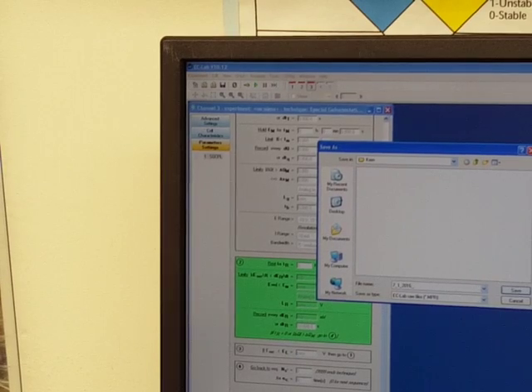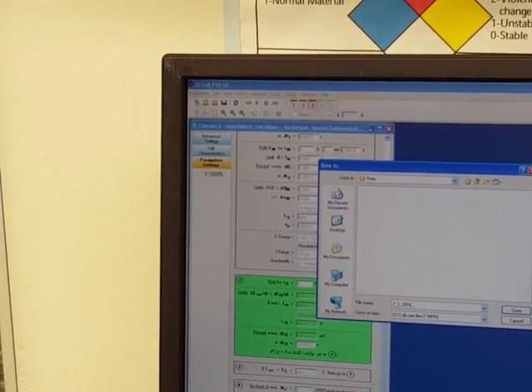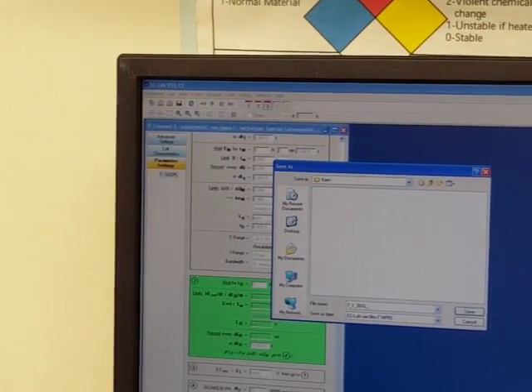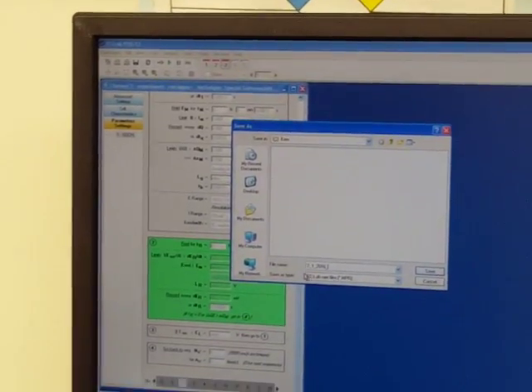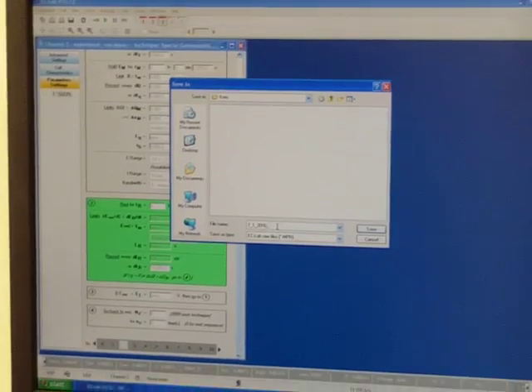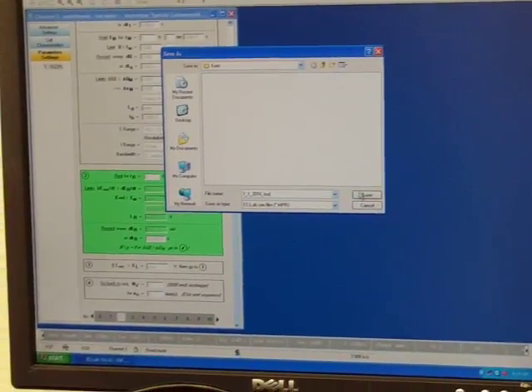So when we flip through our notebook, if we ever look for digital, electronic information on computers or whatever, we can find it just by typing in the date on that book. Does that make sense? Yeah. So we need to make sure that we always label whatever it is we're doing, the date, in this manner here. Okay? And then I can just put test for now.